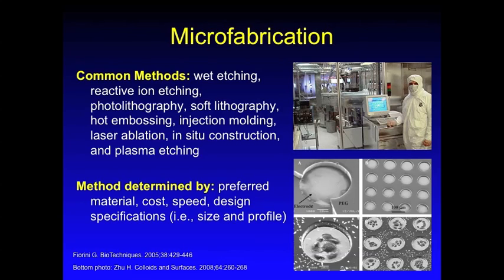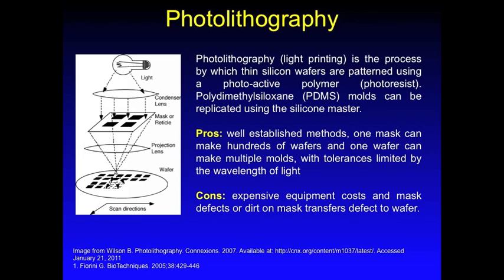Microfabrication of miniaturized diagnostic tests has been heavily influenced by the semiconductor and microelectromechanical industries. Common microfluidic fabrication methods include photolithography, embossing, and injection molding. The fabrication method is determined by the material of choice, the cost and speed of fabrication, and the design specifications.